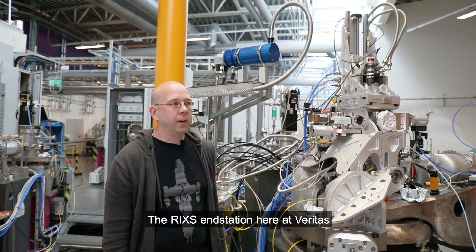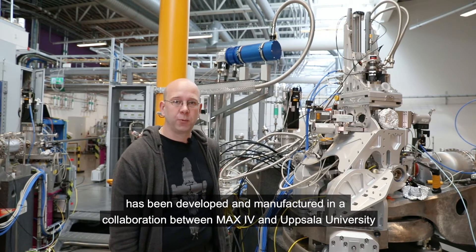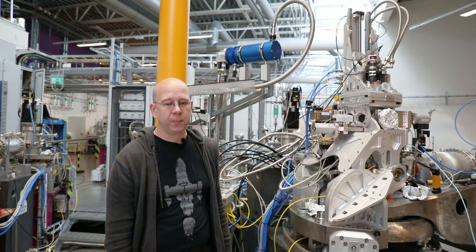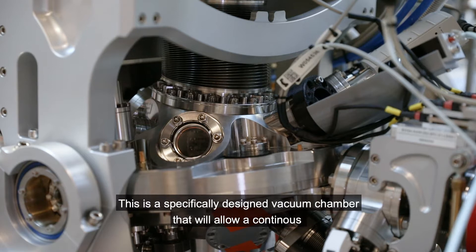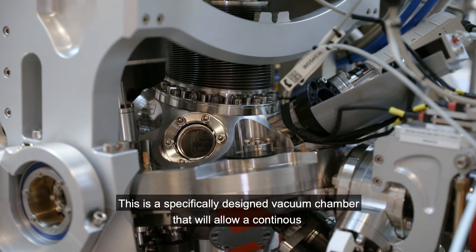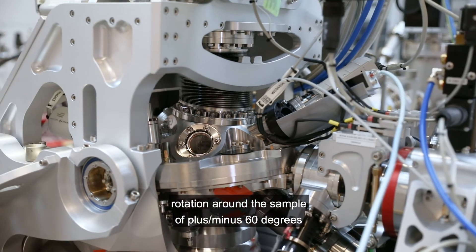The RIXS station here at Veritas has been developed and manufactured in a collaboration between MAX IV and Uppsala University. The heart of the experimental station is the Q-chamber — a specifically designed vacuum chamber that will allow a continuous rotation around a sample of plus or minus 60 degrees.